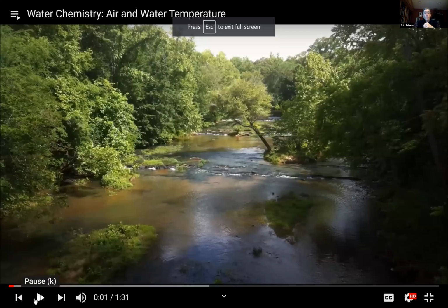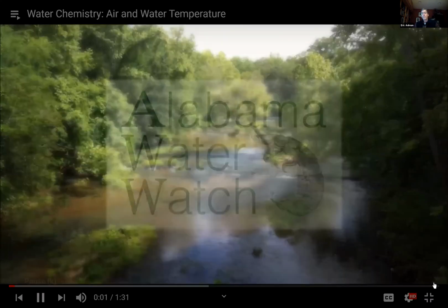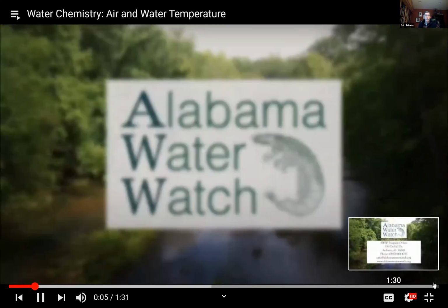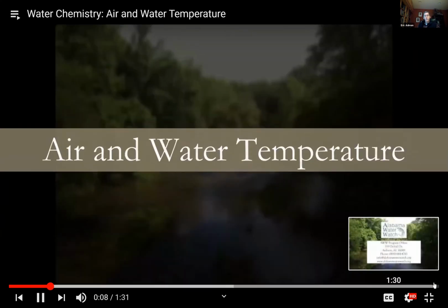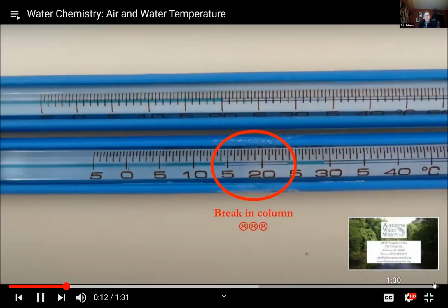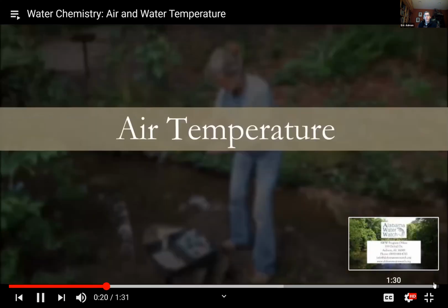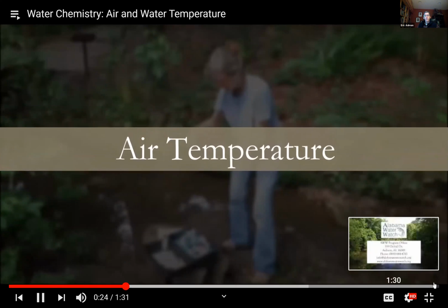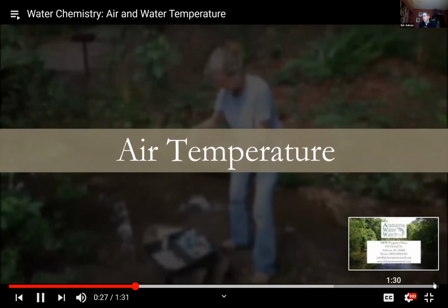Welcome to the Alabama Water Watch instructional video series. This video will show the proper method for taking air and water temperatures. Before arriving at the site, make sure there are no separations or breaks in the thermometer's alcohol column. If there is a break, your readings will be inaccurate. We will start with air temperature. Always take air temperature before water temperature for the most accurate readings.